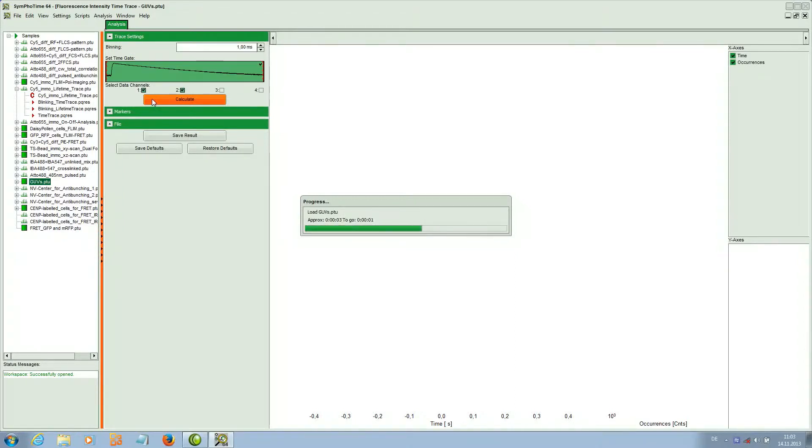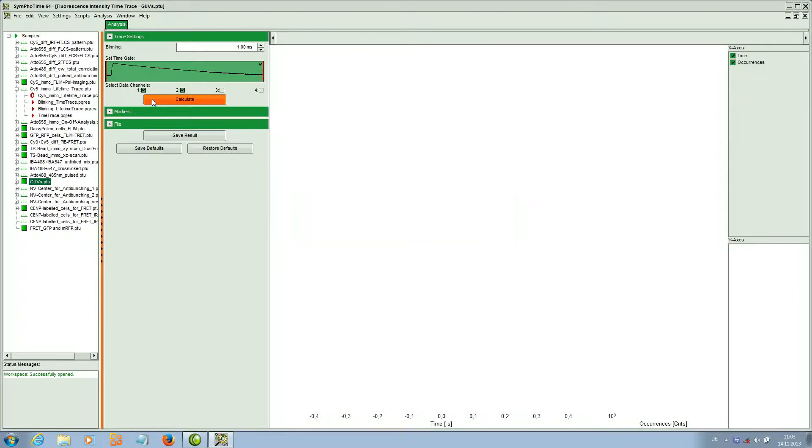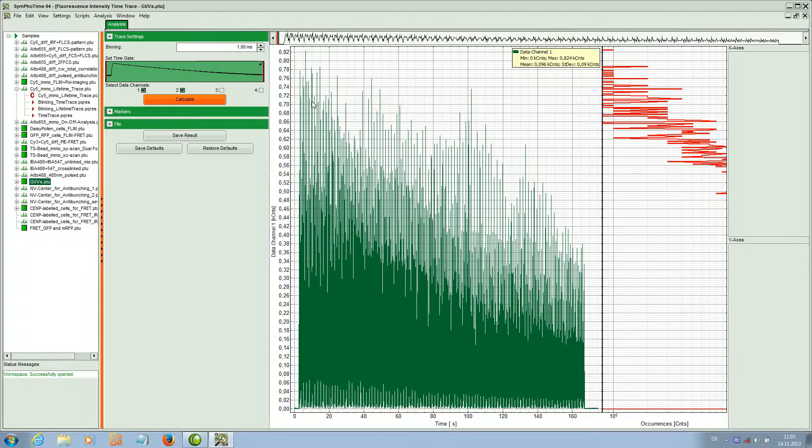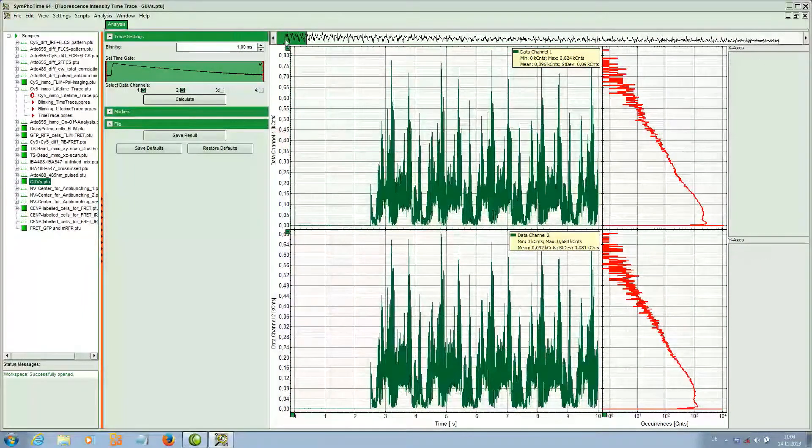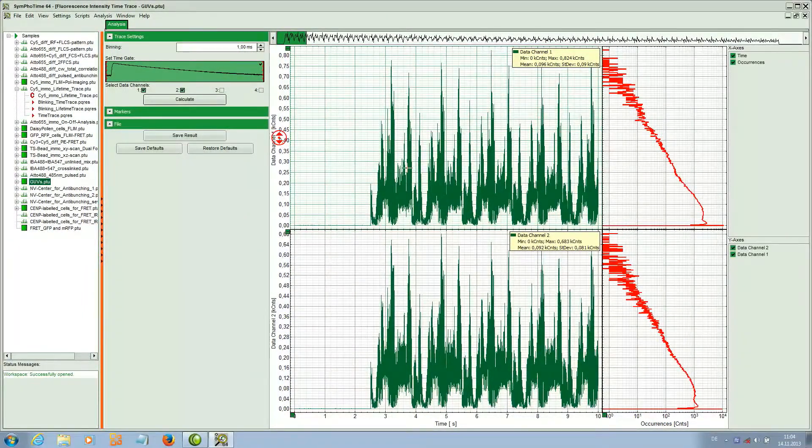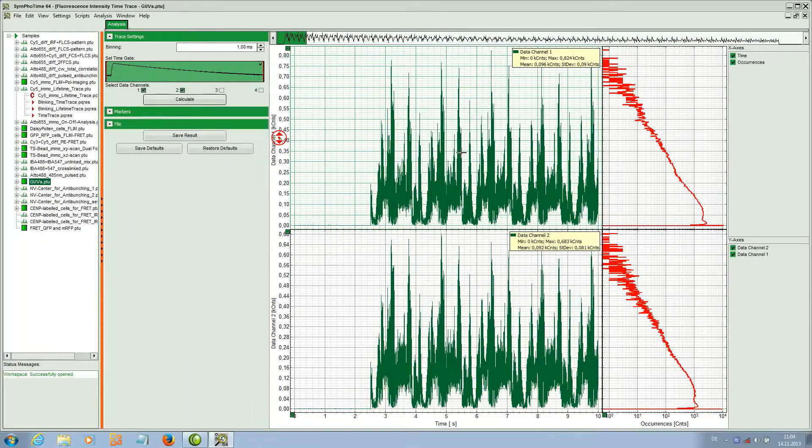We can see that we get now a very spiked kind of time trace which is due to the scanning process of the laser over the sample.